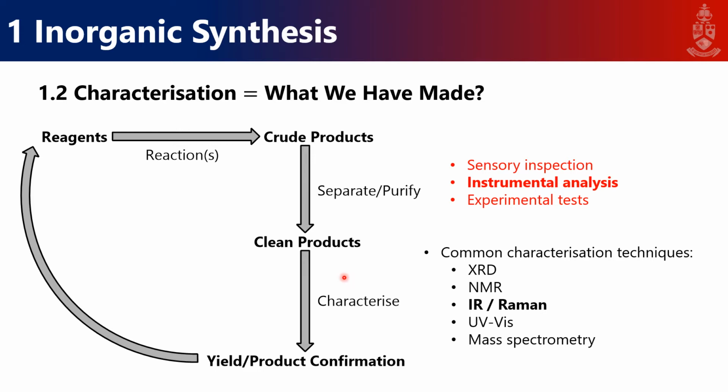Okay. So the point of this experiment is trying to figure out what have we made. Characterization, meaning what have we made?